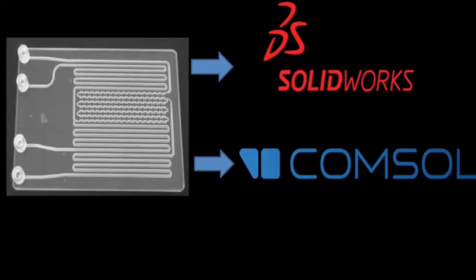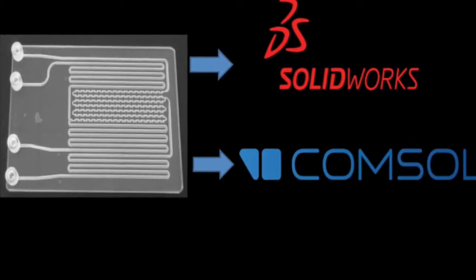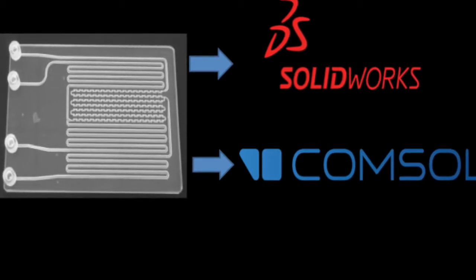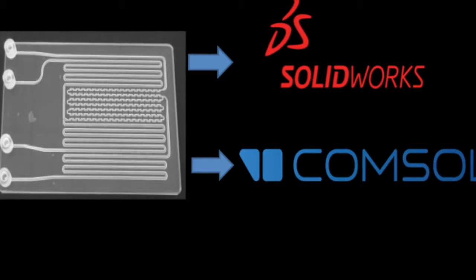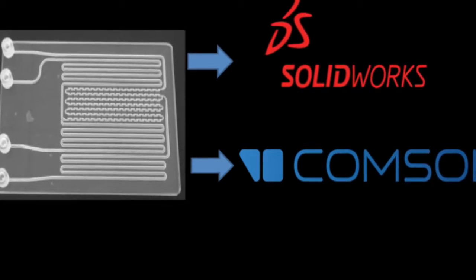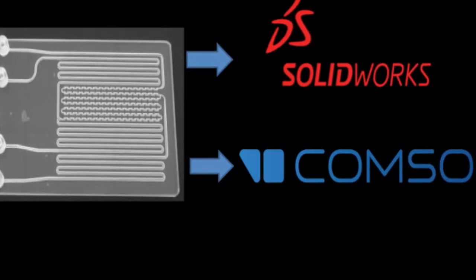The group investigated the effects of varying reactor parameters such as length of the microreactor and the flow rate into the device, and calculated the conversion at the reactor's end. From there, it could be modeled in COMSOL and the experimental conversions compared to the predicted conversions of COMSOL. COMSOL and SOLIDWORKS are both key elements of chemical engineering and crucial for industry use.